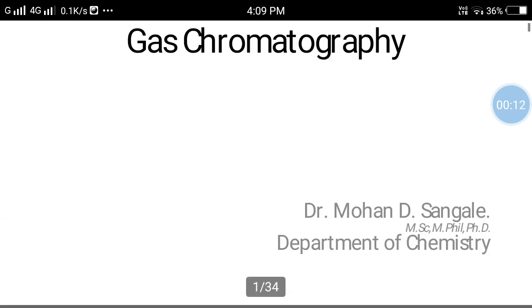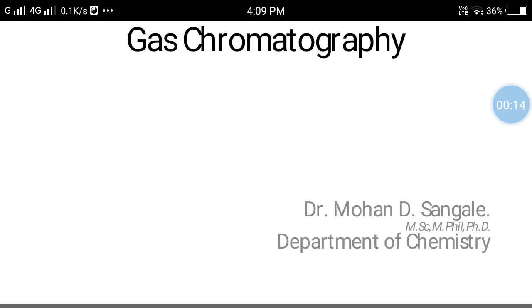Today, my topic is gas chromatography. Gas chromatography is a separation technique. Here, the gas is used as a mobile phase. Therefore, it is called gas chromatography. The chromatographic technique was first discovered by the botanical scientist Mikhail Tswett in 1906.